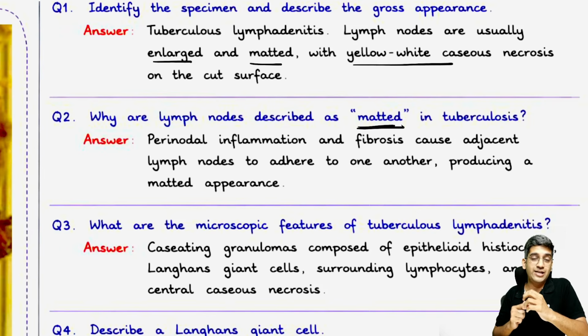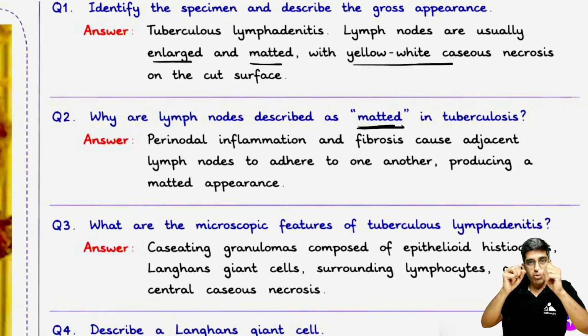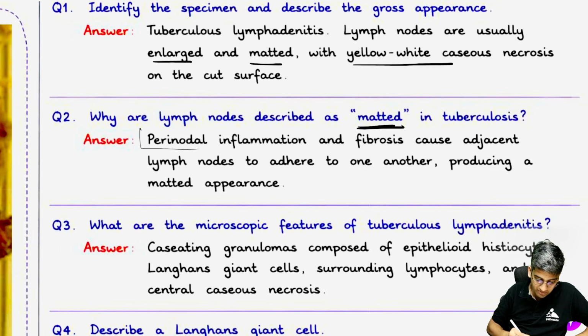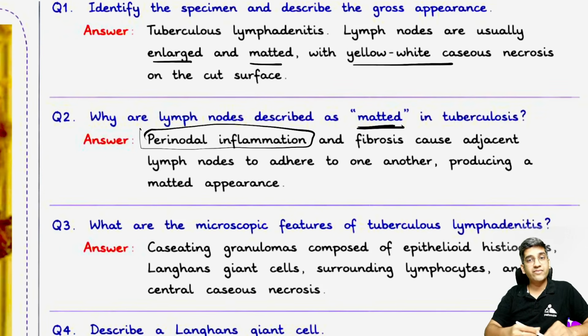That is very important. Let's say two lymph nodes are there, and both places have pericapsular inflammation. That kind of fixes them. We call that periadenitis: periadenitis, perinodal inflammation, pericapsular inflammation. If you see any one of these words, that's important for me.